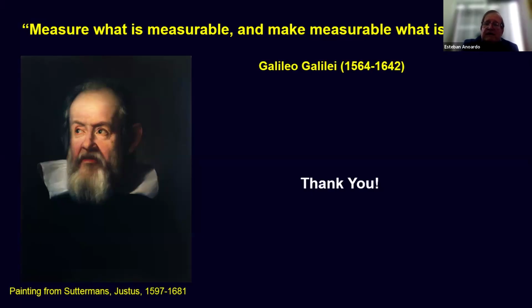But maybe you go to a completely different system and you have absolutely no idea. Then, if you cannot measure it, you can collaborate with someone measuring diffusion constants in that kind of system. It's tricky. If you want a fine result, you should be very careful with that, and this is independent of the model or the fitting engine you use.